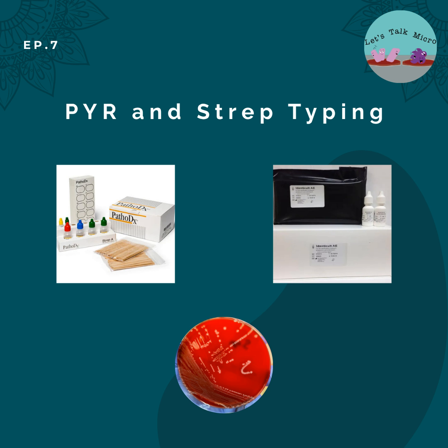Anginosus, with the disclaimer that you should never smell plates, gives a butterscotch odor. So just a little FYI. So there you have it. That's just your basic workup when you have gram-positive cocci in the lab.